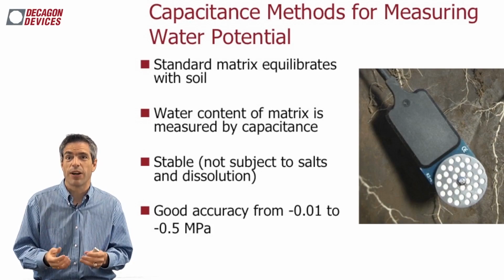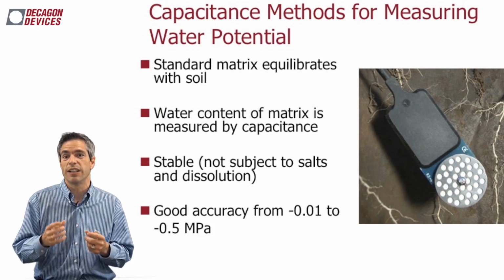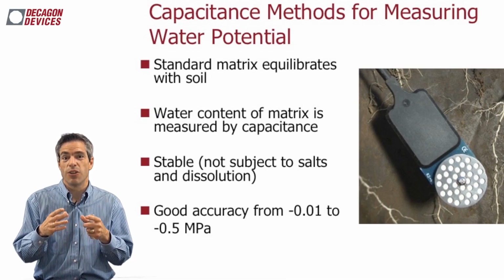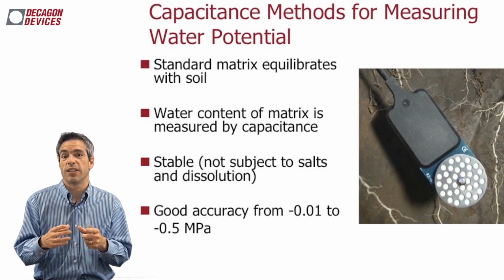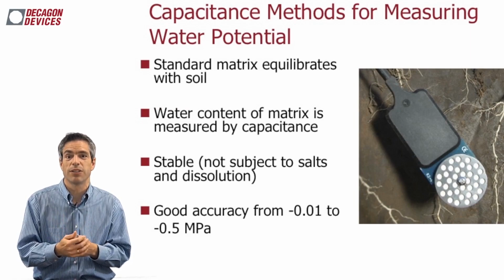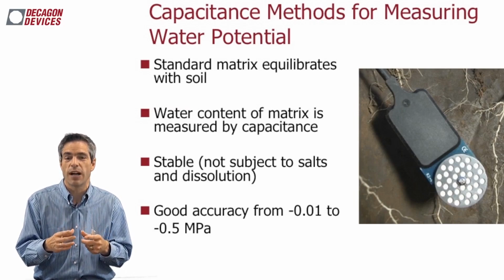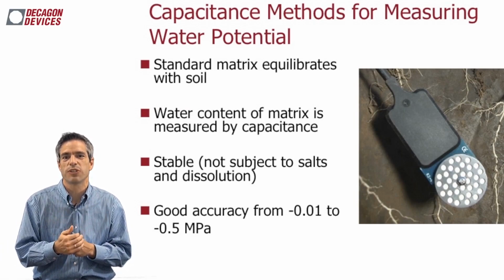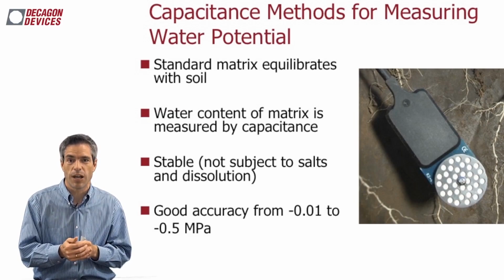The next one we're going to talk about is the capacitance method. Now, in a very similar manner, instead of the gypsum being the matrix that we're measuring, now we're actually going to measure a ceramic disc. These ceramics have been designed and perfected over the last 30 to 40 years, and I do mean that. In soil physics labs everywhere, people have been trying to come up with the greatest ceramic they can find, so that every time they mix a batch of this together, it comes out with the exact same pore size distribution, i.e. that SWCC is the same for each one of these ceramics.